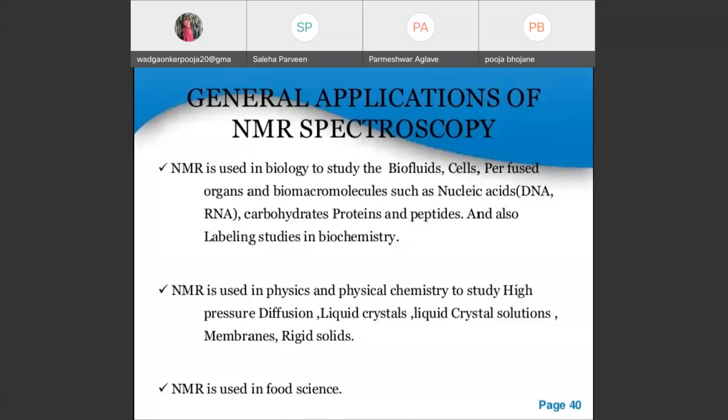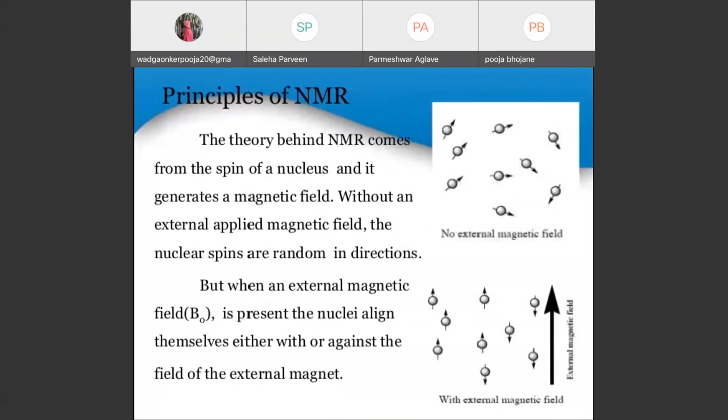To learn this, I would like to ask you, do you know the things which are related to NMR spectroscopy? What do I mean by this? See, whenever we have NMR spectroscopy, there is a nucleus which is NMR active, obviously those which have I value not equal to 0. Am I correct or wrong? Spectroscopy, what does it tell us? The principle of NMR spectroscopy is telling us information regarding the spin of our nuclei.